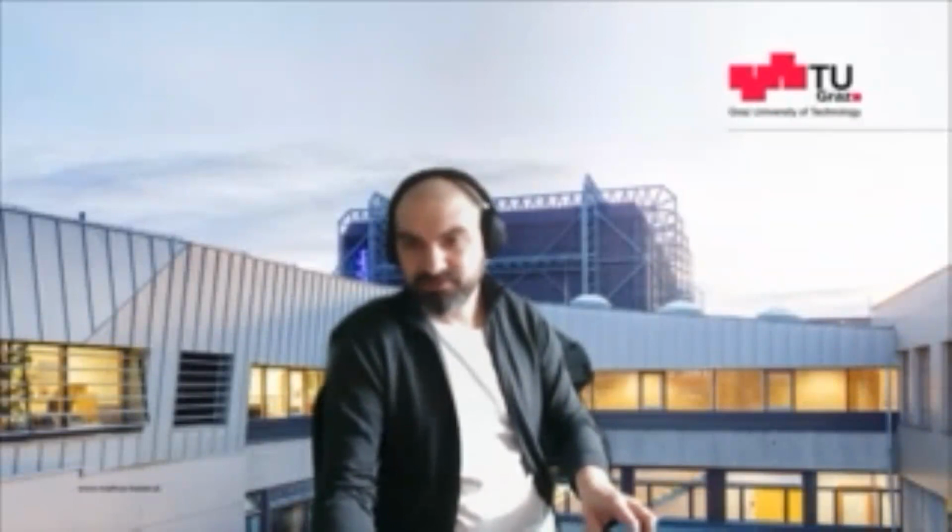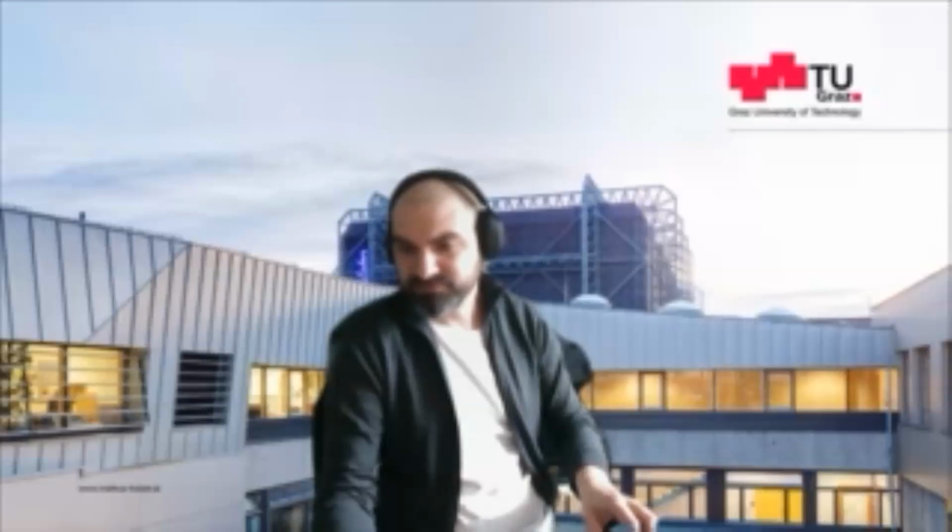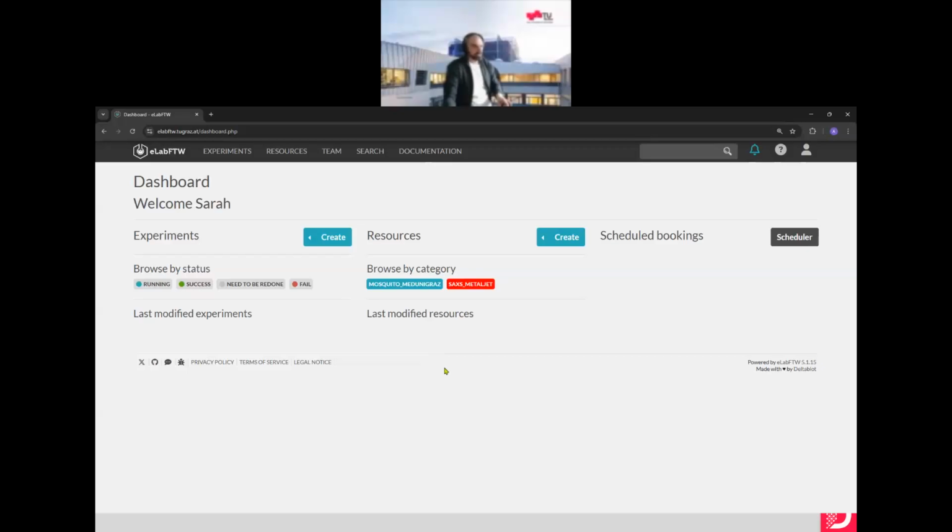The thing I want to do now is to log in as another user. And my other user is called Sarah. And now I will again share my screen. Yeah. Okay, so I hope you can see my screen again. I'm now logged in as Sarah, and Sarah is a team admin. So she has the rights to do a little bit more than our user Max before.